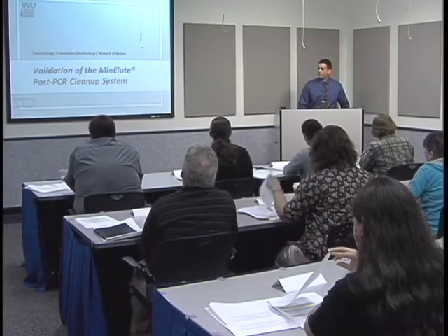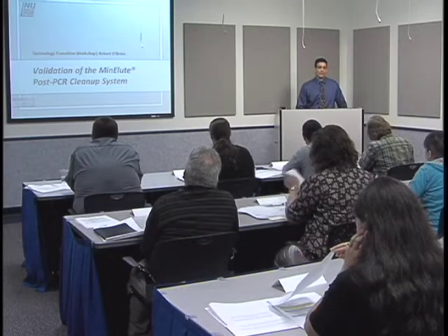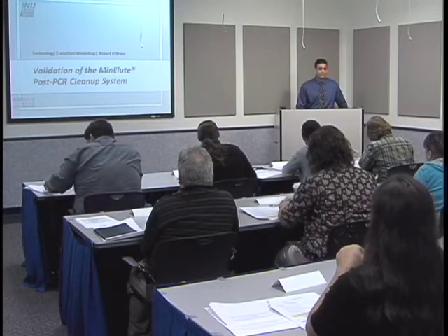The next lecture here, basically, I wanted to look into some of the requirements that a laboratory will have to do to implement this into their system, which is basically the validation of the post-PCR cleanup. Because as much as I've said, it's a very easy process to do. When you put this into your lab, your interpretation procedures now may have to change, because all of a sudden now you're looking at stuff where before you may not have had anything, and now you're having a profile. And how are you going to interpret that?